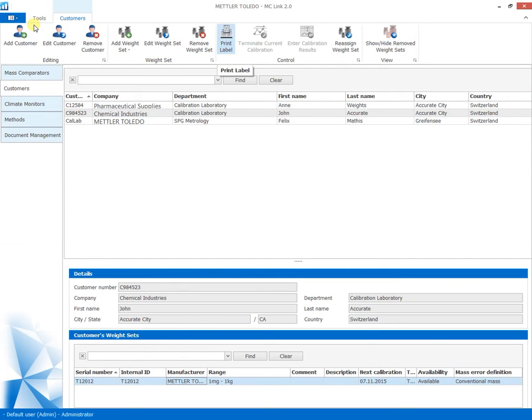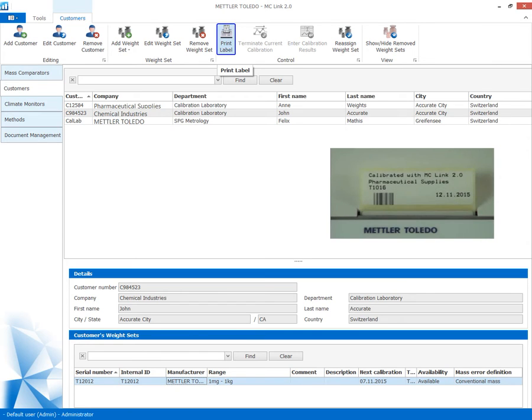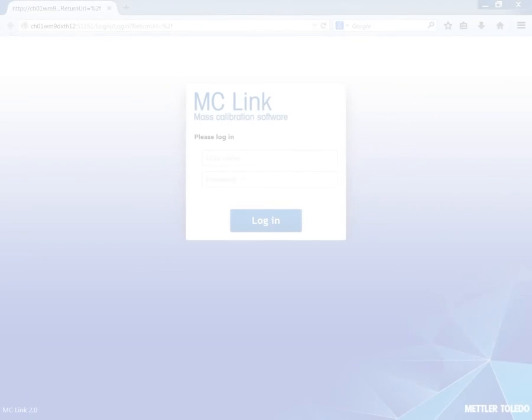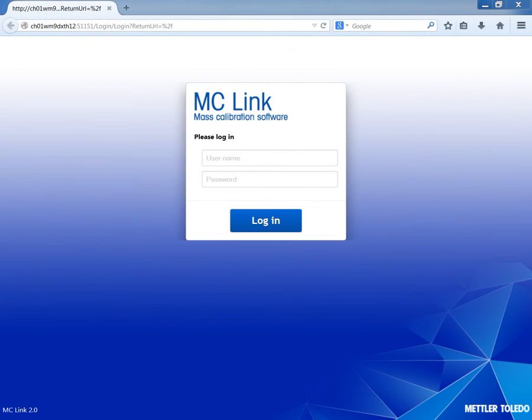To enable the highest data security of the calibration results, a barcode reading option is available, allowing fast and secure recognition of the weight set ID.